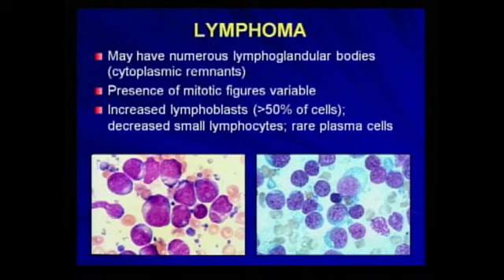The aspiration of lymph nodes is somewhat based on luck. There are 60 or more types of lymphoma with varying architectures that have been diagnosed in domestic animals. Okay, I don't know if all of those are true, but the experts say that there are 60 or more. And they all have different types of architecture. And based on how you aspirate these nodes, and if you make one stick or multiple sticks, you can have aspirates from the same node which look extremely different.